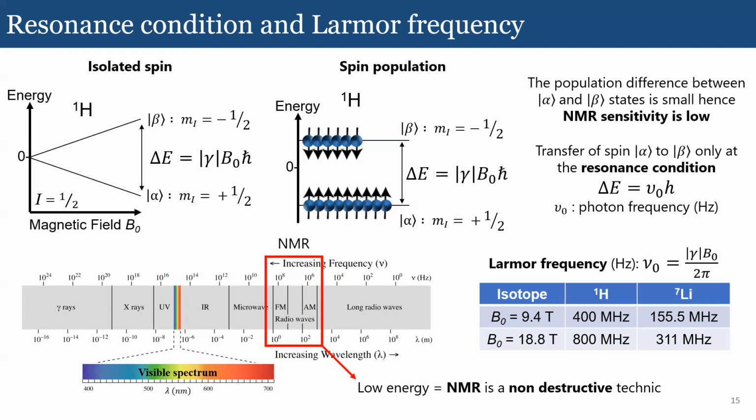For NMR, it's going to be the same, not in the same radio frequency range, but the same principle. The problem is that the states are nearly equally filled, because the Zeeman splitting is not that favorable to the alpha state. That distribution comes from the Boltzmann distribution. I haven't talked about that here, but that's why the population difference is very small.